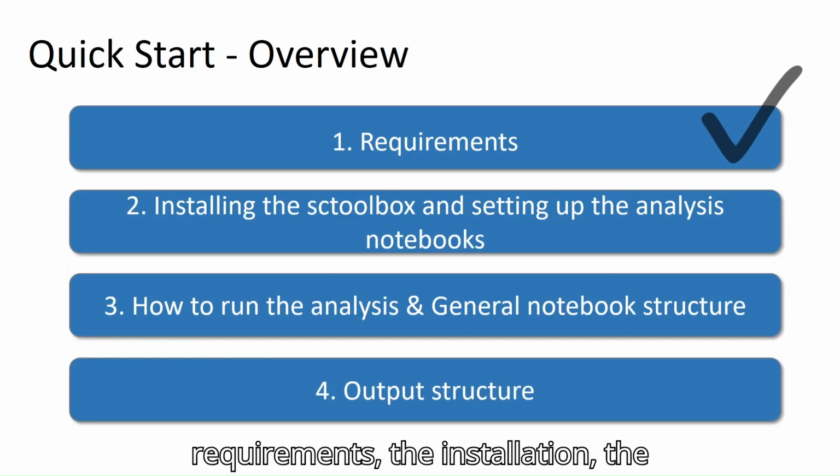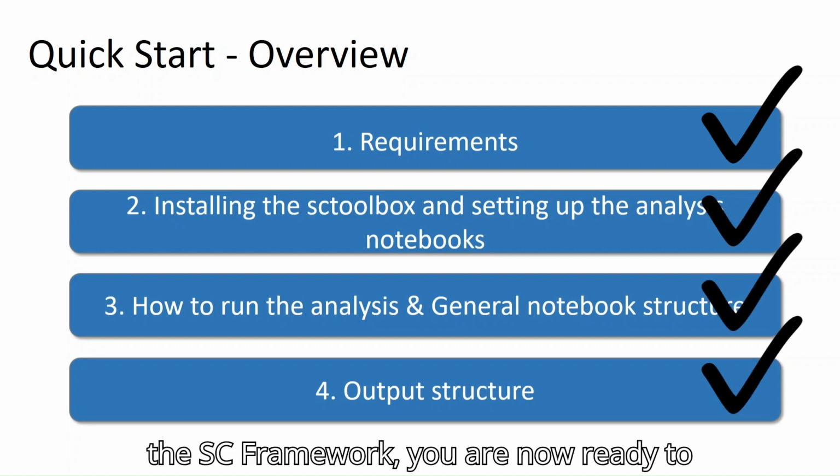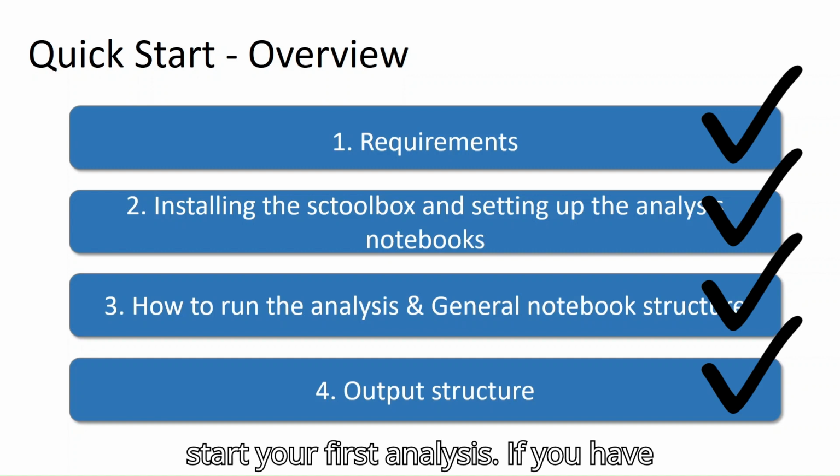Now that we've walked through the requirements, the installation, the notebooks, and the output structure of the SC framework, you are now ready to start your first analysis.